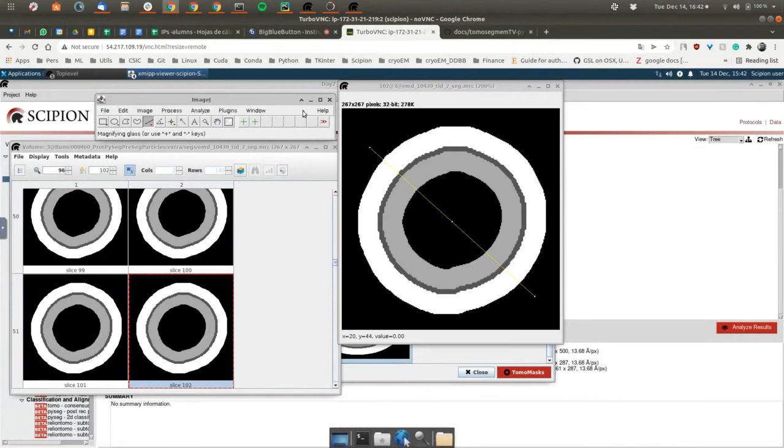All this is due to the graphs, because at the first stages of the calculations it's calling a very powerful program called Disperse, which uses all the resources present in your machine. Sometimes at the beginning of the calculations it can be difficult to carry out any other graphical operation. So, were you able to render it, Luca?